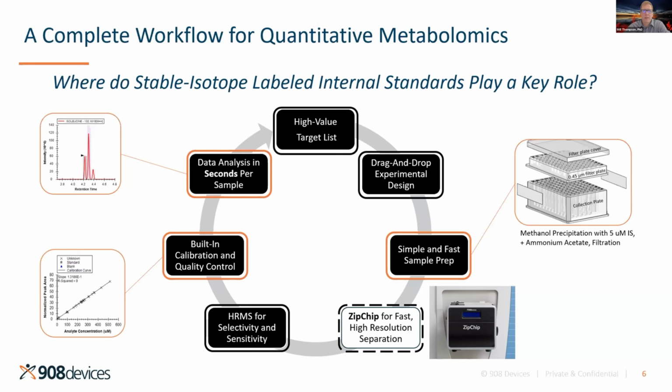And then the final use, which I'll spend some time on today, is using those isotopes to improve the speed of our data analysis. An example shown in the top left is isoleucine, leucine, and alloisoleucine, which are the same mass. So we have to utilize some very intelligent algorithms to make sure that our algorithm can pick up the correct peak for the purposes of quantitation.